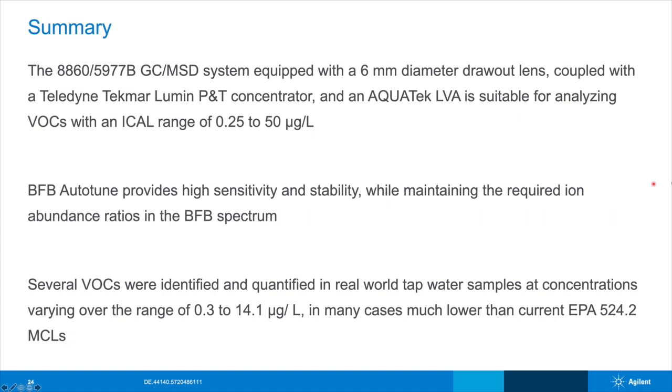And finally, several VOCs were identified and quantified in real-world tap water samples at concentrations ranging from about 0.3 to 14 microgram per liter. In many cases, much lower than the current 524.2 MCLs.